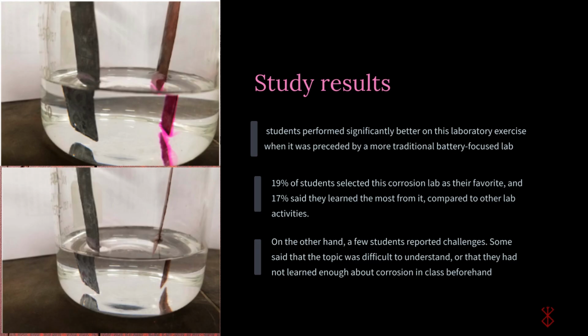Students who enjoyed the experiment described it with comments such as a heavy emphasis on what you will see in the fluid, interesting to see the different reactions within the solution, and cool to actually see corrosion happening. These comments highlight the visual and practical nature of the experiment, which is especially effective for learners who benefit from hands-on and observable results.